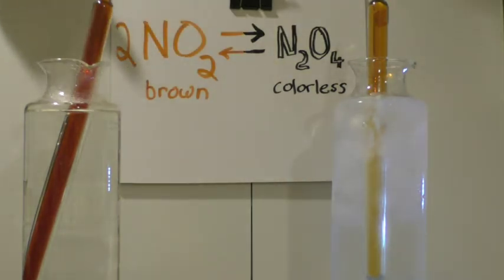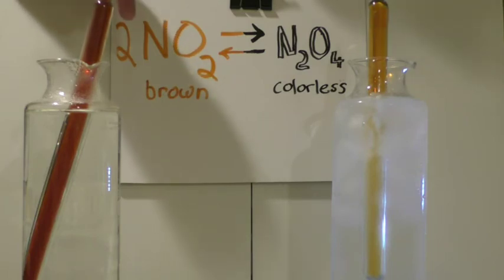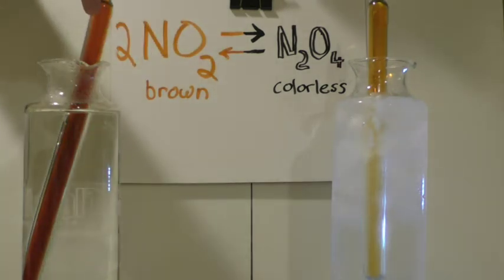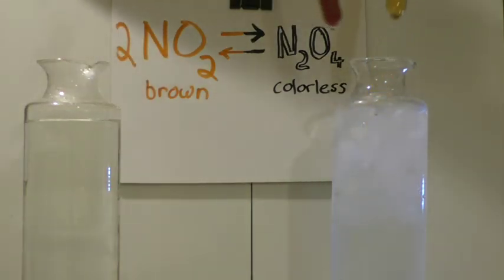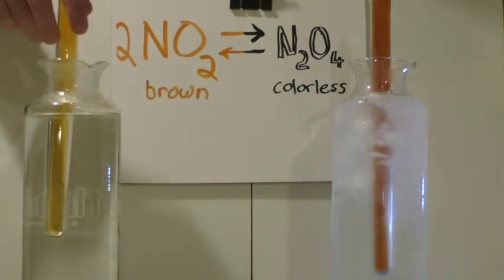I can push this reaction one way or the other. And it also tells us that inside the tube at any temperature, both the forward and reverse reactions are probably happening at the same time. Some NO2 is being converted to N2O4, and some N2O4 is being converted back into NO2. So let's just watch me push that back and forth by changing the temperature.